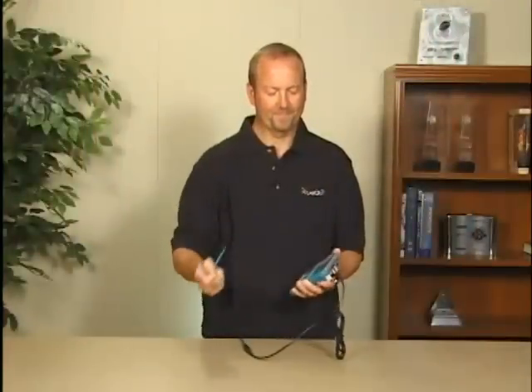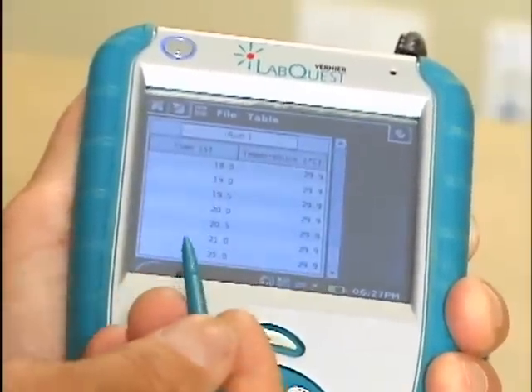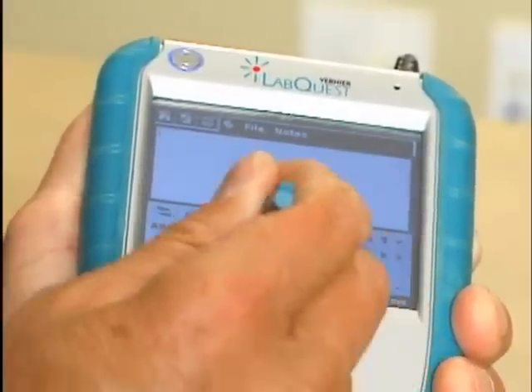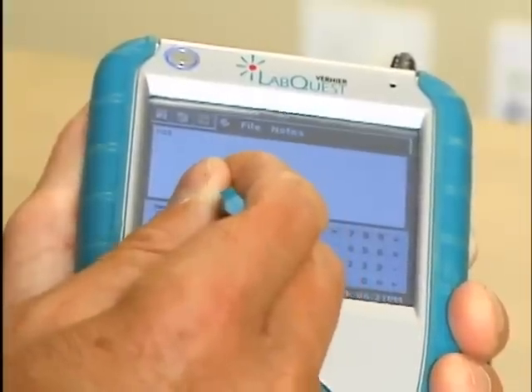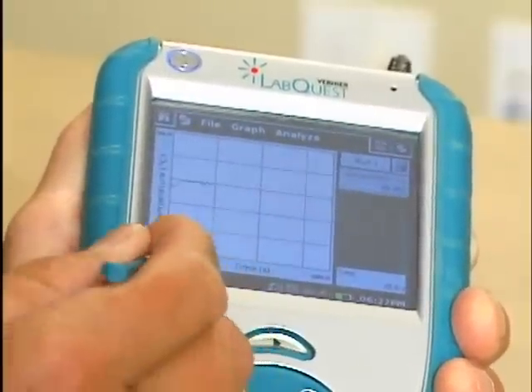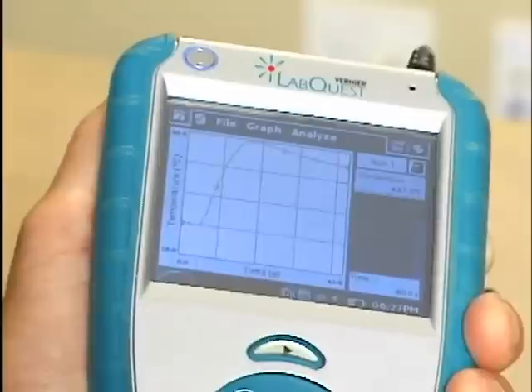I can show you some more features as the data is being collected. Pull the stylus out if you want — data collection is still going on. It's building our data table over here, and over here there's a place where students can take notes about the experiment. You can go back to the monitor window or the graph window, and you can start and stop data collection with that button.